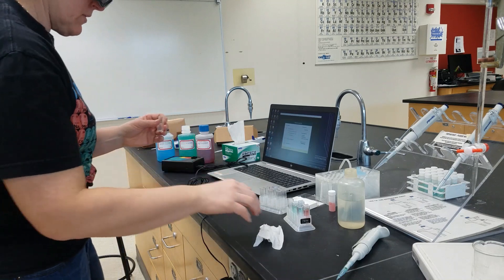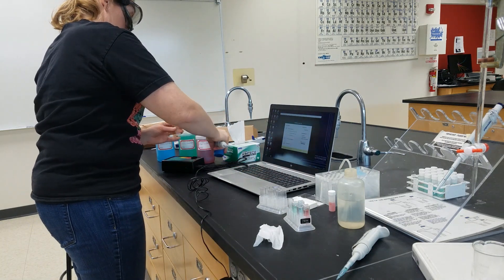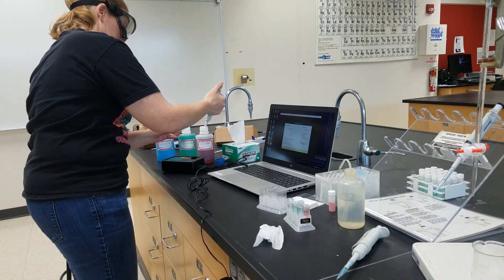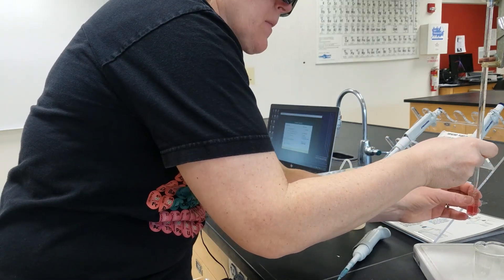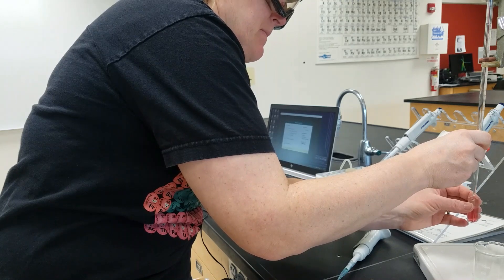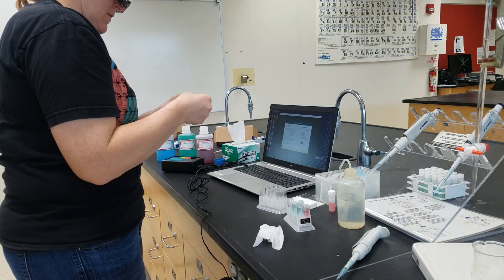And finally our cobalt solution — one and a half milliliters.